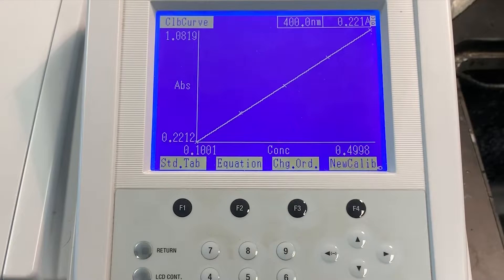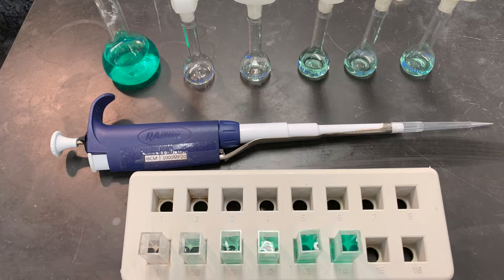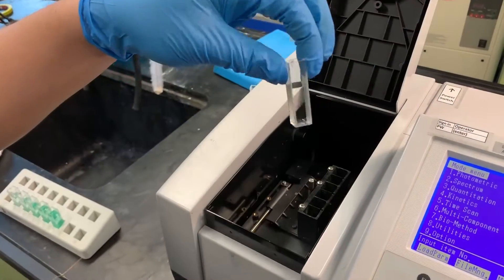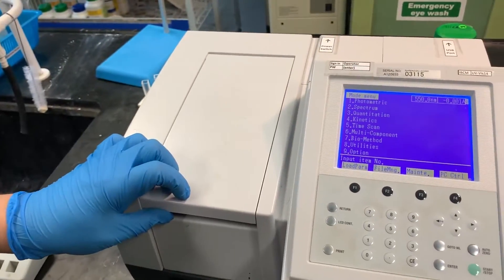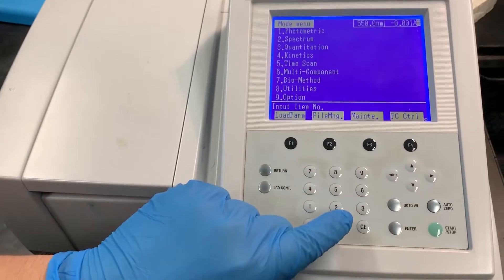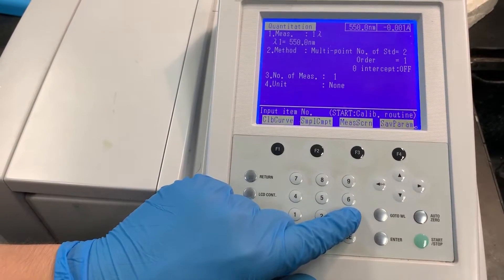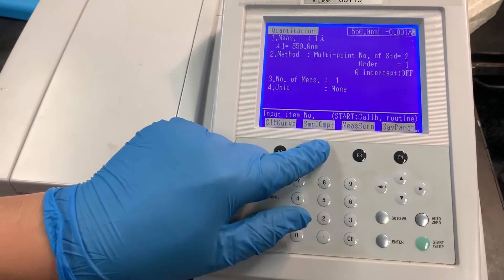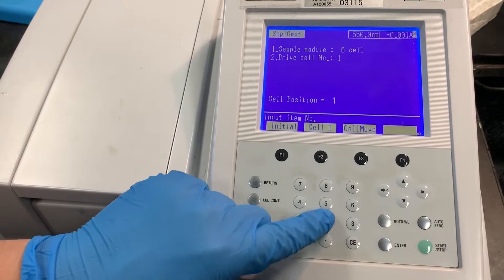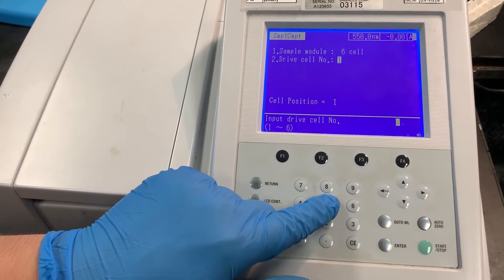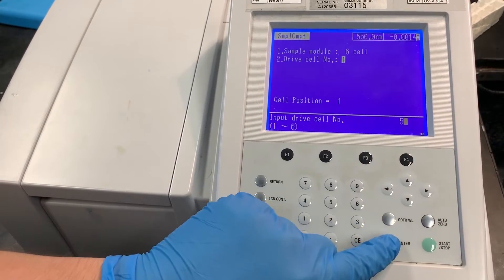Now we'll learn how to make a calibration curve. To do so, you'll first need to prepare a micropipette, standard flasks, and cuvettes containing solutions of different known concentrations. Insert a blank cuvette into the machine. Select quantitation, sample compartment, and adjust the drive cell number to the number of cuvettes you are going to use.